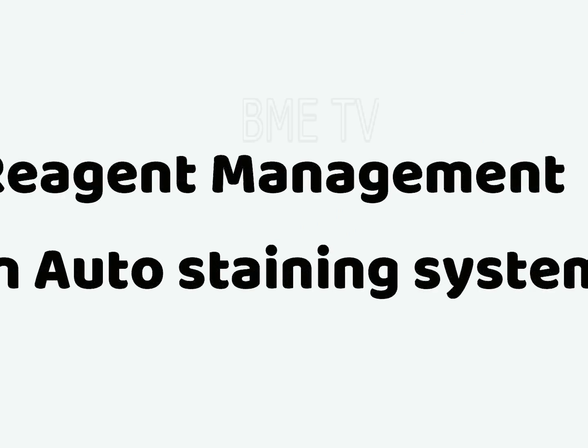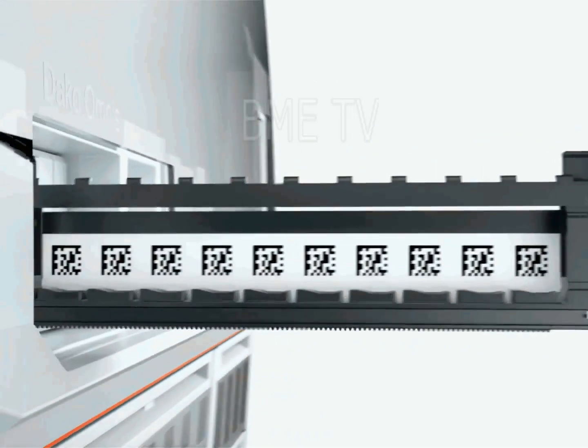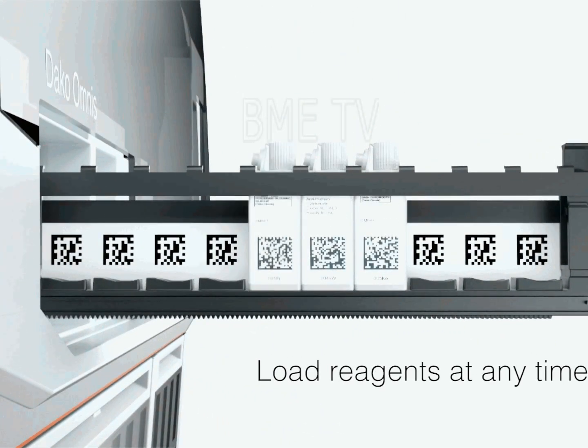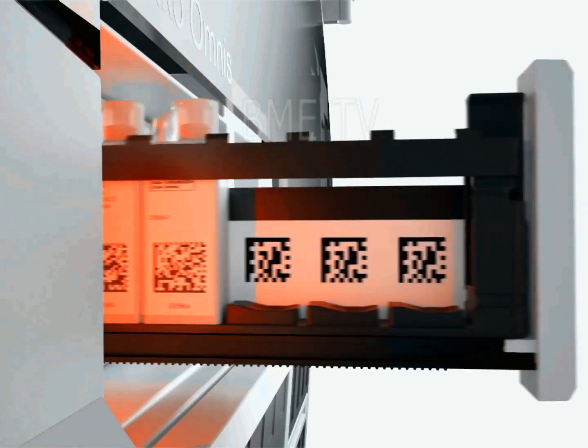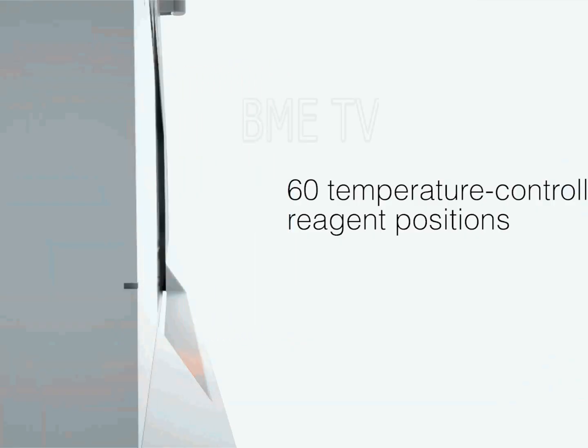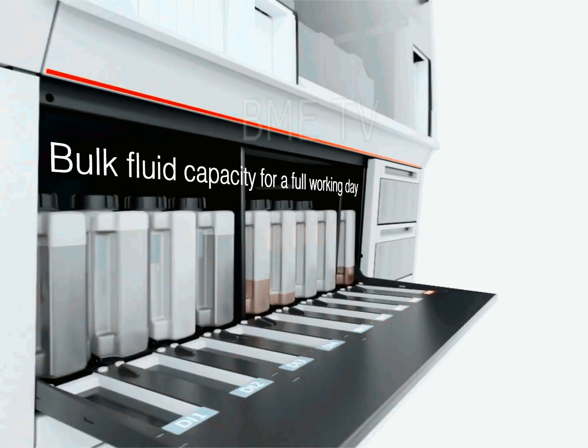The third component is reagent management. The number of reagent containers that can be loaded onto automated staining platforms from different vendors varies greatly. In general, more slots available for reagent containers enables more antibodies and detections to be run without swapping out containers. Some systems offer cooling of reagents, which may be particularly valuable for labile reagents such as alkaline phosphatase.